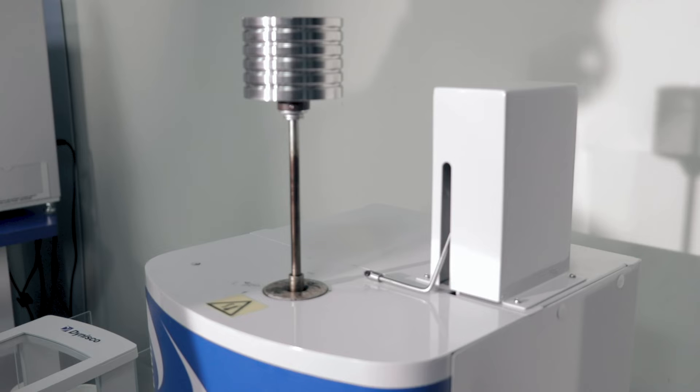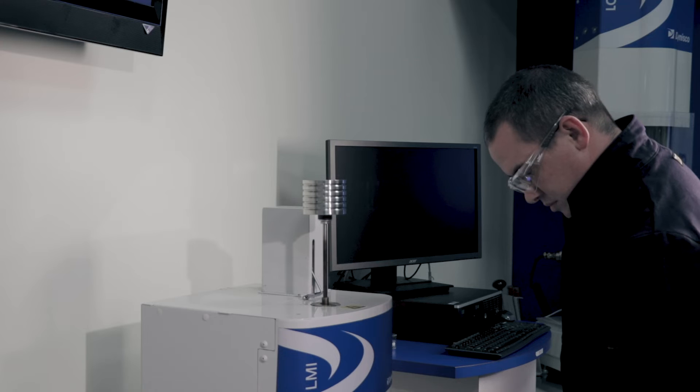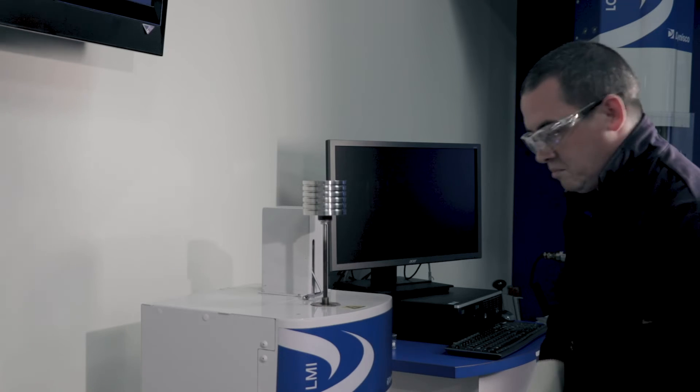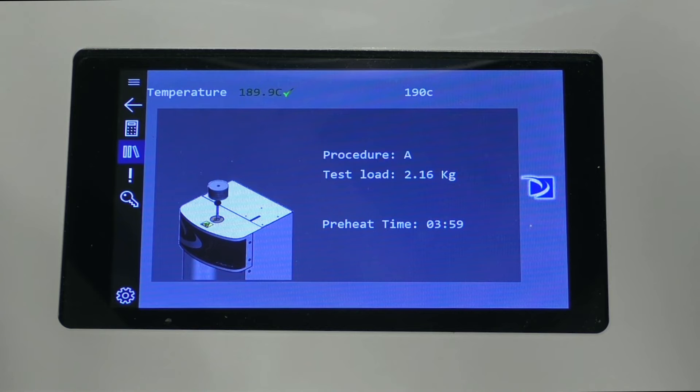The weight load is selected from the table of the ASTM standard, respective ISO standard, or the supplier specification sheet. Now the attendant must wait the preheat time for the polymer to melt.